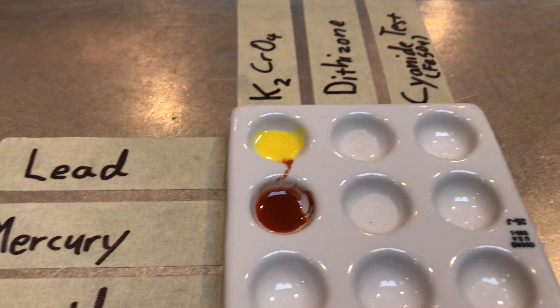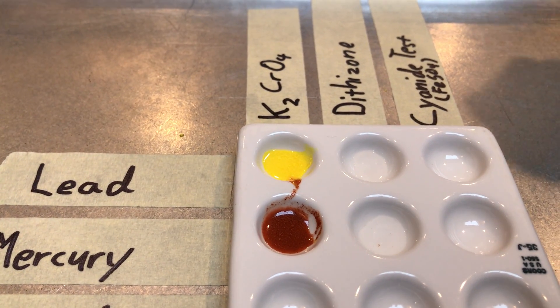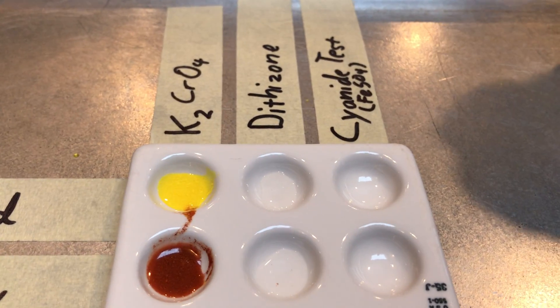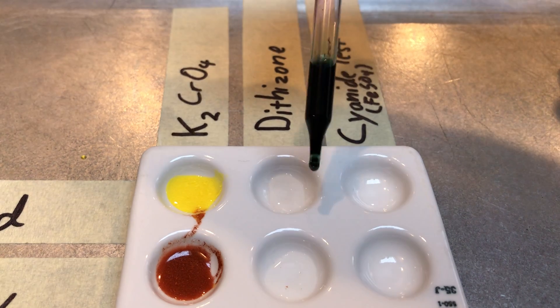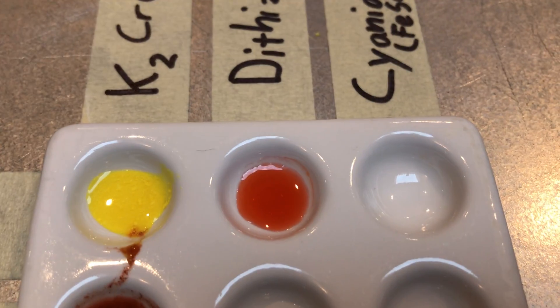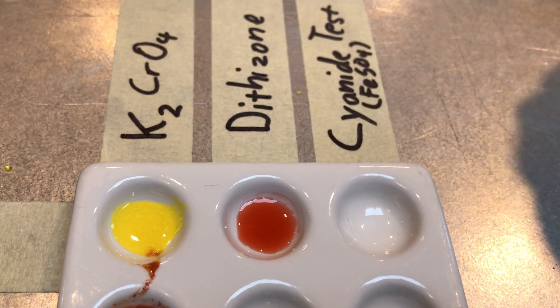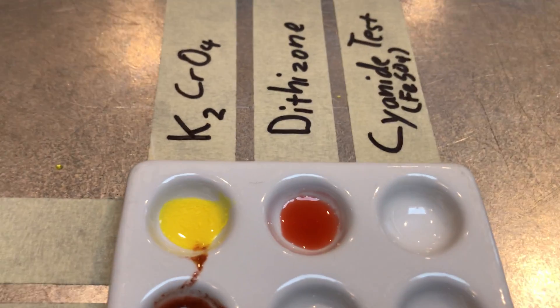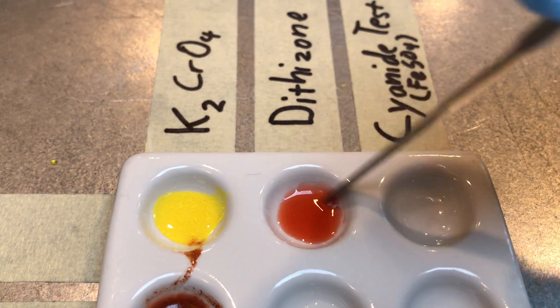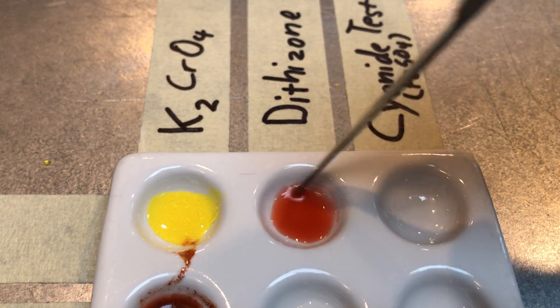Bridget, if you wouldn't mind adding the dithizone to our lead and mercury solutions — first two drops to the lead. If we look closely, you can see kind of an orange color forms. Give it a stir please. It really just kind of turns an orange color — really nothing going on there.